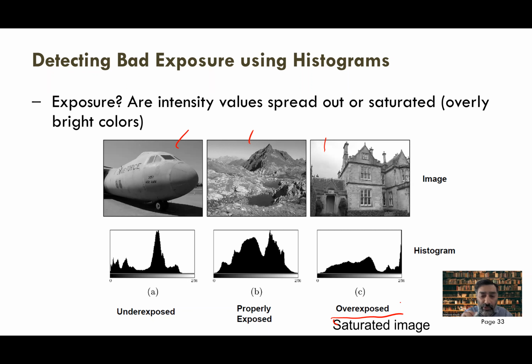How do we know that? We're going to look at the histogram. So you create a histogram from the image, and then you see there are lots of pixels that have a maximum value, 255. You never let your pixel touch that maximum value. In research, these are called saturated values. That means you don't really know what the actual value of the pixels could be here.